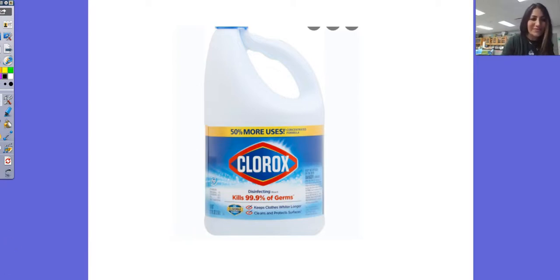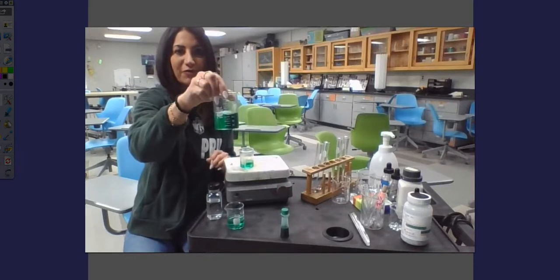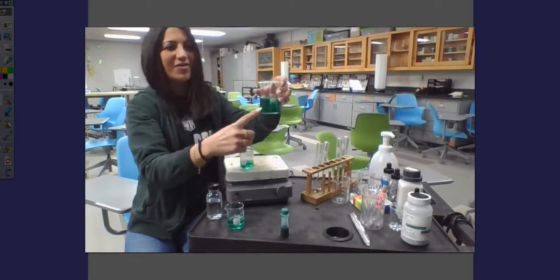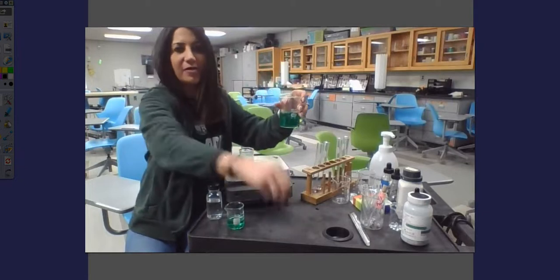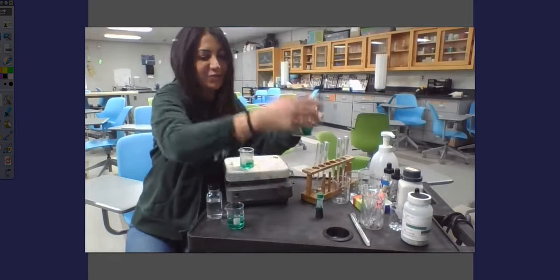So let me enlarge this so you can see what I'm doing here. I simply have water with food coloring. That's why I'm not wearing goggles right now. This is literally just one drop of food coloring and some regular tap water.